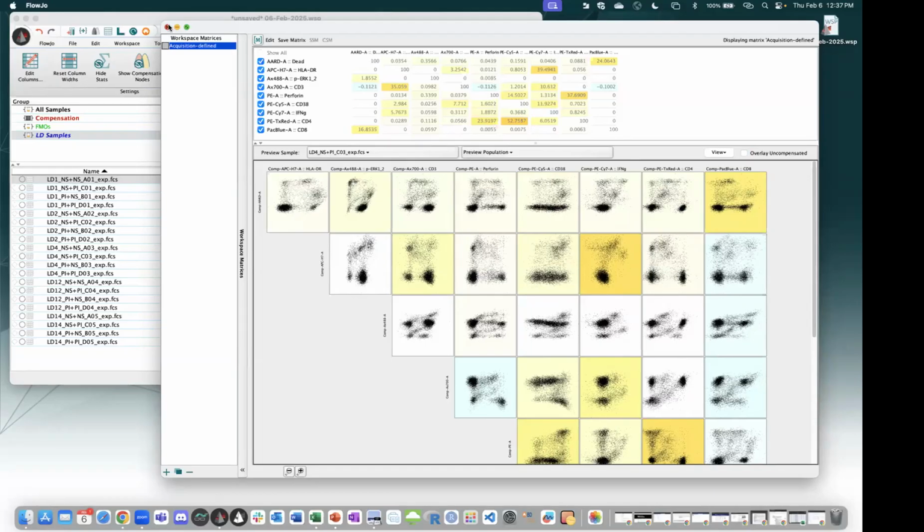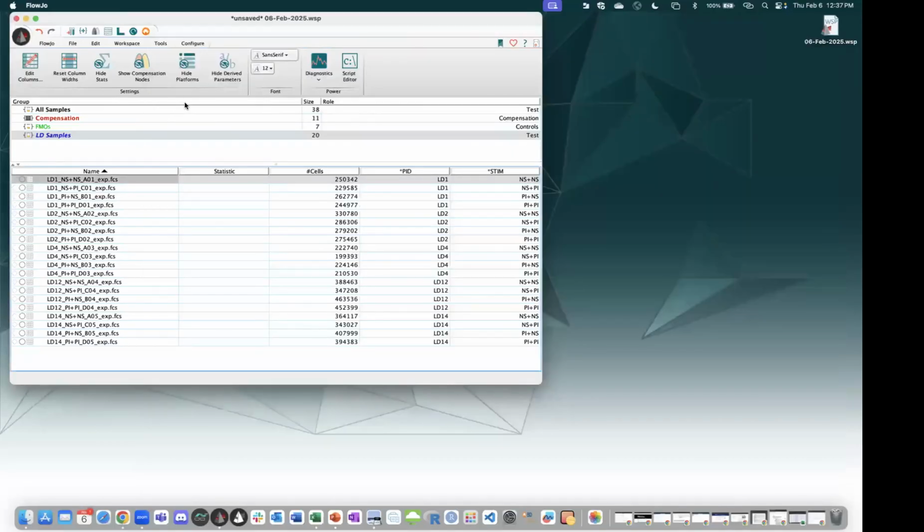If you want to redo your compensation, you can do that in FlowJo. We have an hour talk on our website. Just go to FlowJo.com and the webinar page, the same place where you registered for today, and go at the bottom, to the recorded webinars, click on it, and you're gonna find the previous presentation that we've done on compensation.